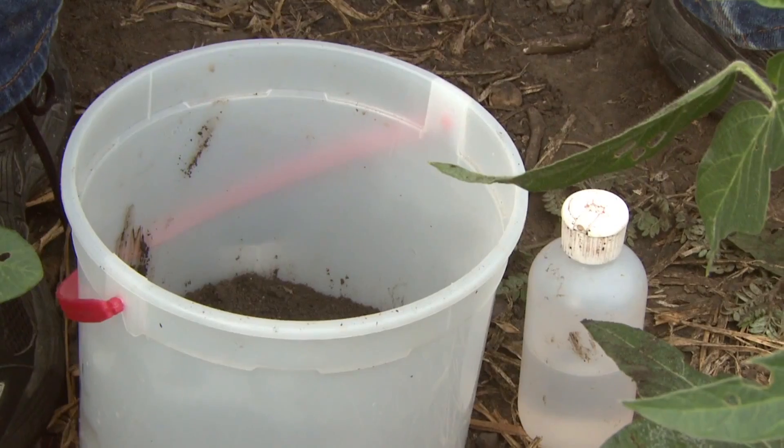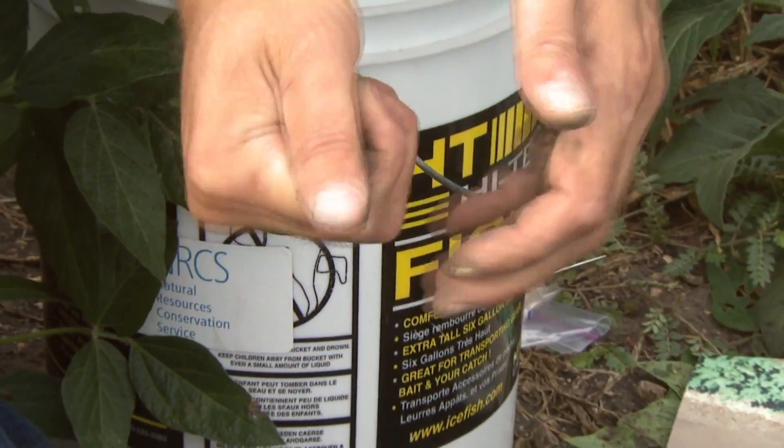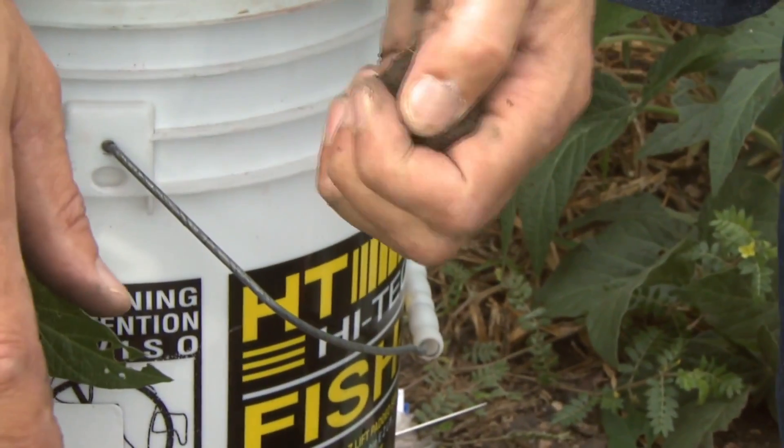You want to take a composite sample of the area you're testing, so you don't take it just from one spot. To start, we're going to take 25 grams of soil in the palm of my hand and add water if it's not moist enough. In this case I've already pre-added water.